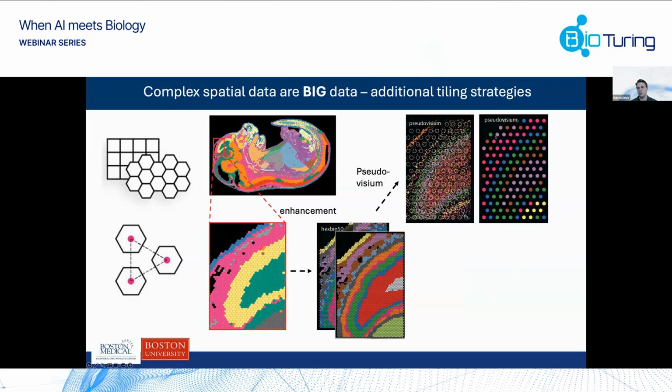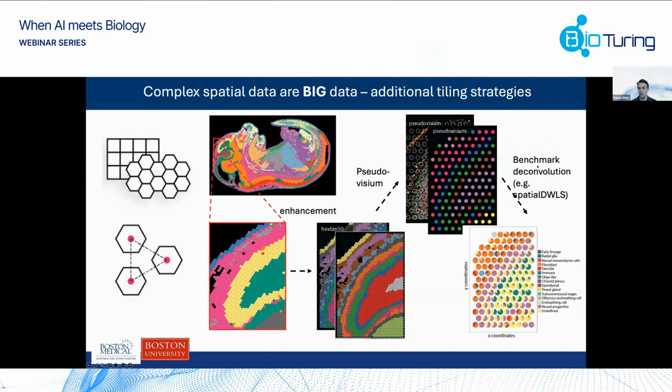And I think that's interesting because when you have this pseudo-Visium, a lot of people want to know, how do I do deconvolution of this pseudo-Visium? What is the best tool? There are really many tools. But by doing this, you can benchmark your deconvolution, right? Because you can use any type of tool, and we have SpatialDWLS. We also have this other one that is very popular. You can basically use whatever you want if you can connect it. You can generate the data, but you can now immediately go back to the original data, and you have a ground truth that you can compare. You have an idea like, oh, okay, if I have other Visium data, then this might work better in my case than something else.